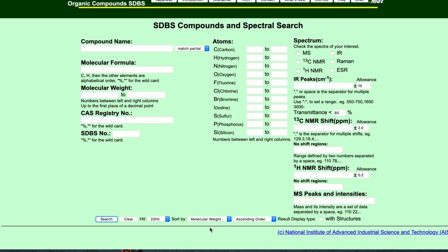There it is. Now, you can obtain, over on the right, but I'll show you a different way, what's called the mass spectrum, infrared, C13, H-NMR, Proton NMR. We will not use Raman or electron spin resonance. I had all of a week's training in that when I was a graduate student. I don't know those areas, and you don't have to worry about that in your first year of organic. Those are highly specialized areas. However, all organic chemists and biochemists use mass spec, C13, Proton NMR, and infrared.